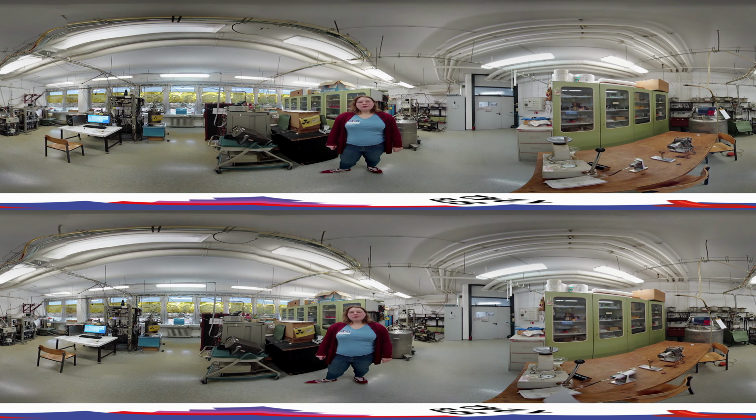Iron-57 Mössbauer spectroscopy is a very useful tool to study the magnetic structure of iron-bearing minerals, as it is non-destructive and has a very high sensitivity. With the help of this technique, we can reach resolutions of about 5 neV. A cobalt-57 source emits gamma rays with an energy of 14.4 keV.